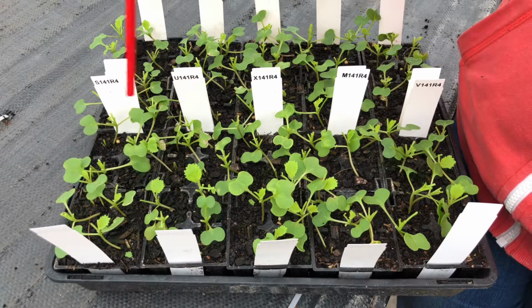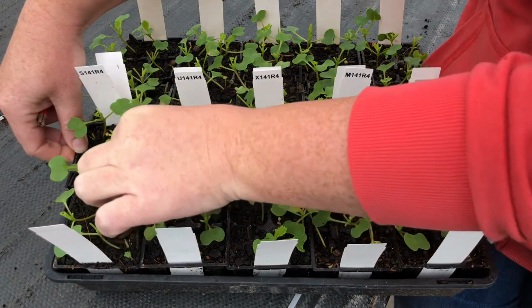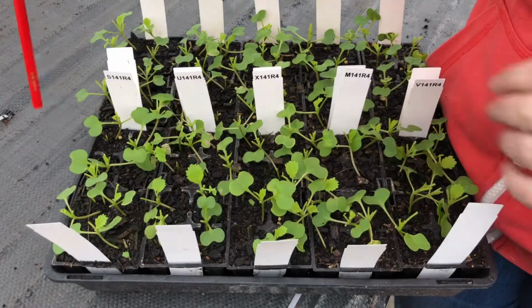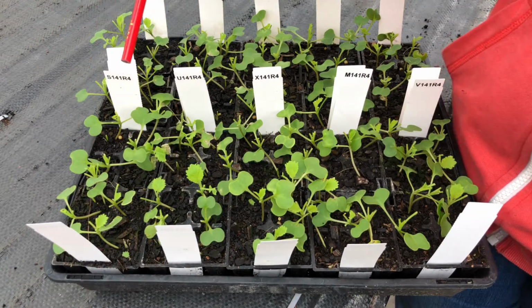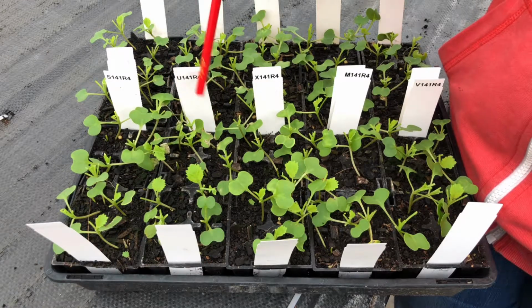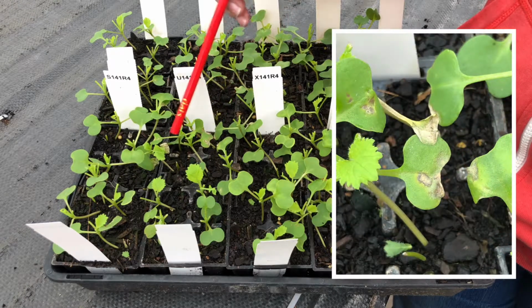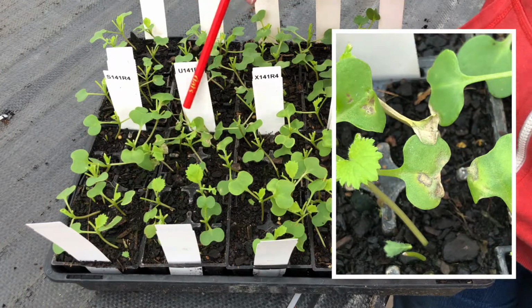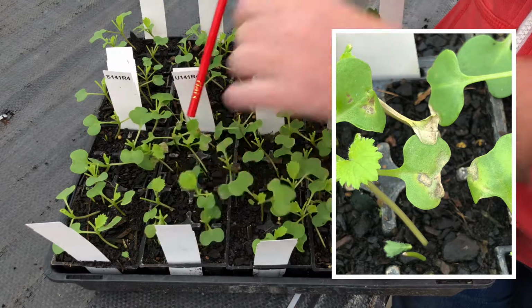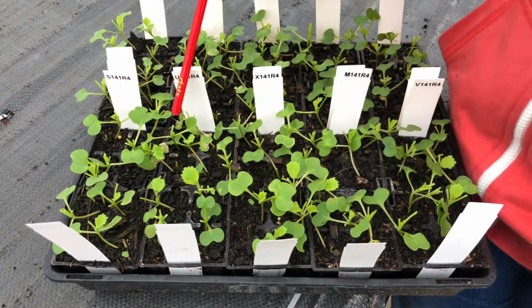Each half punnet here has 4 plants in it, and each one of these is treated with a different fungicide. So here, these 4 plants are what we call our untreated control, so they've got no fungicide. And you can see there's lots of lesions developing, and actually some of these plants are completely collapsing under here from the disease pressure.